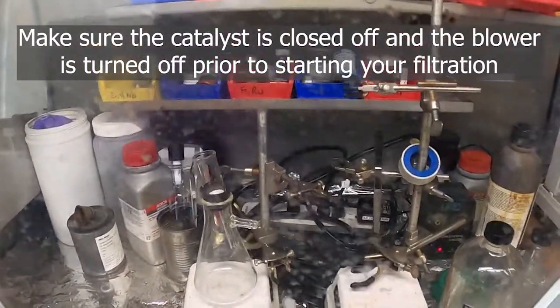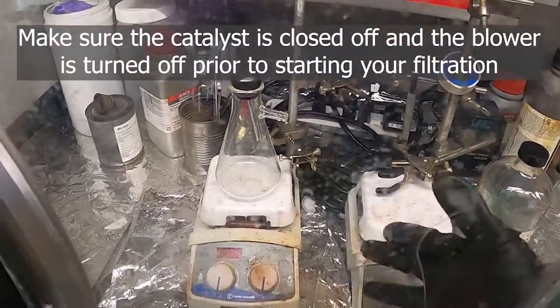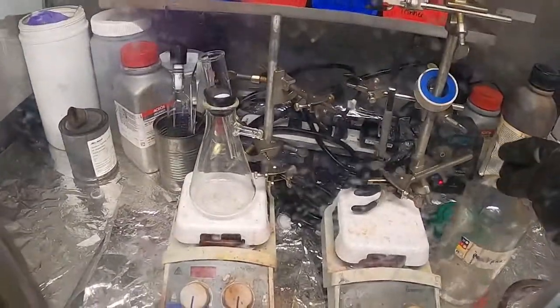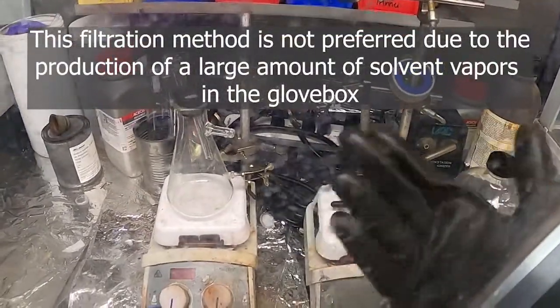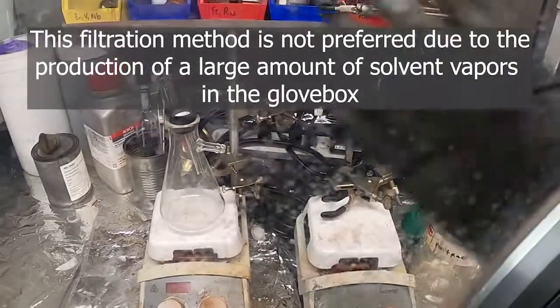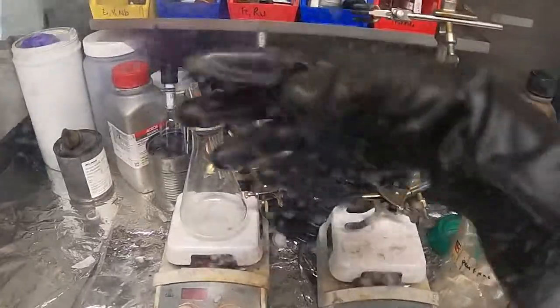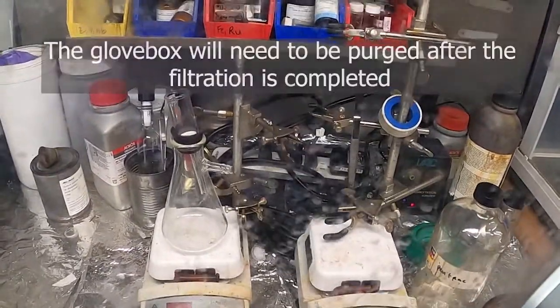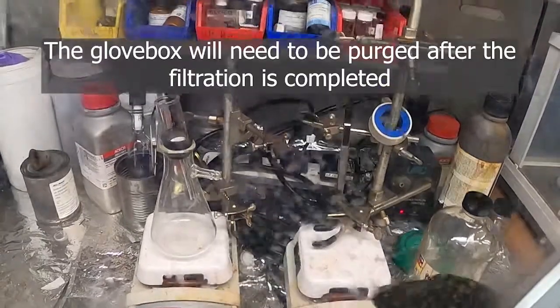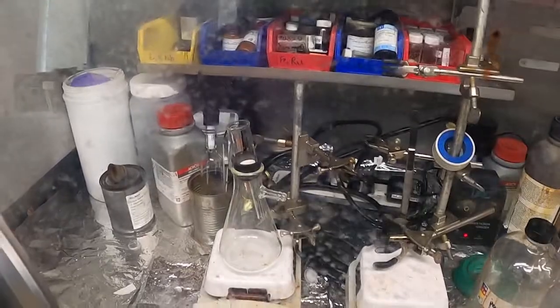The downside of this is that certain solvents you can't use — anything that's going to damage your catalyst you'd want to avoid. The downsides of doing air-sensitive filtration in the glove box are the solvent fumes that you get in your glove box atmosphere, and it's also a little bit more difficult than doing it on the bench. But this is one option, and if you can't do this, there are other options.